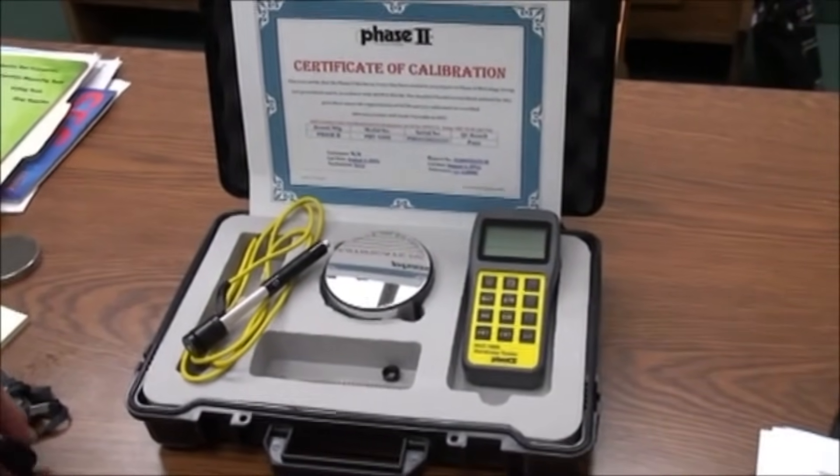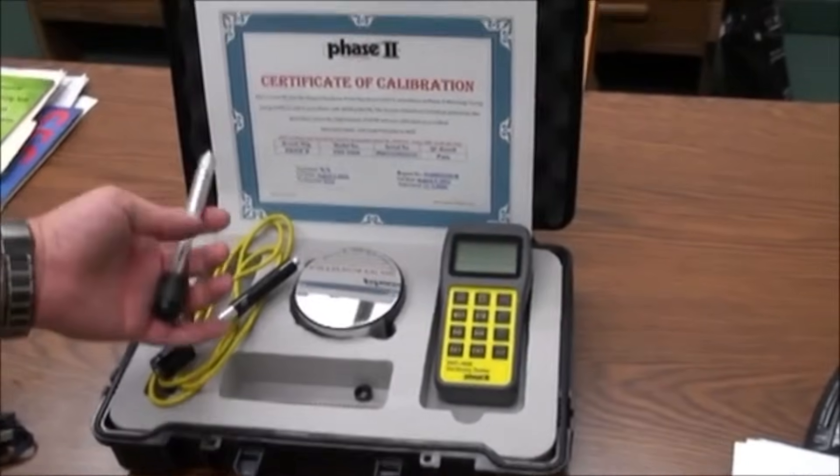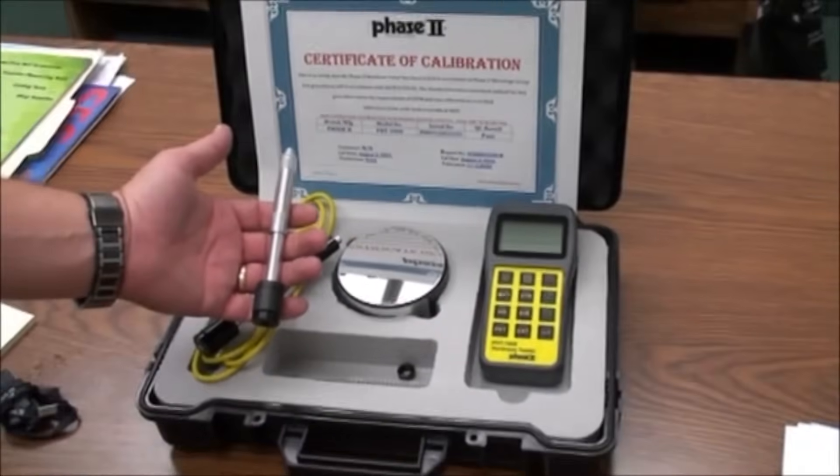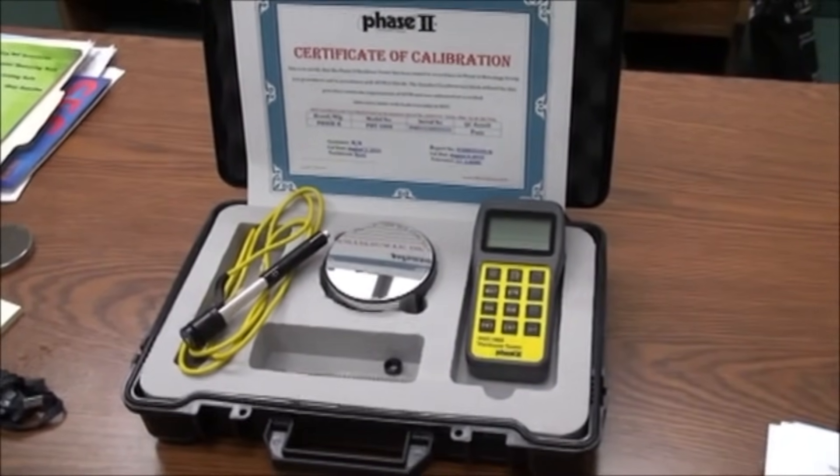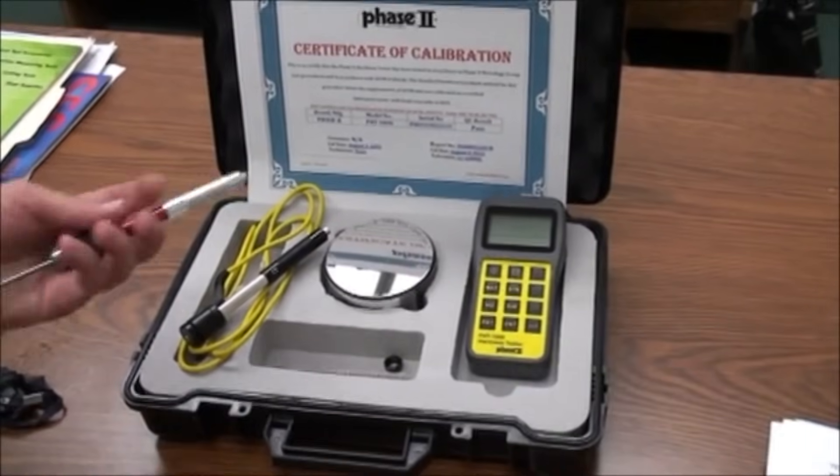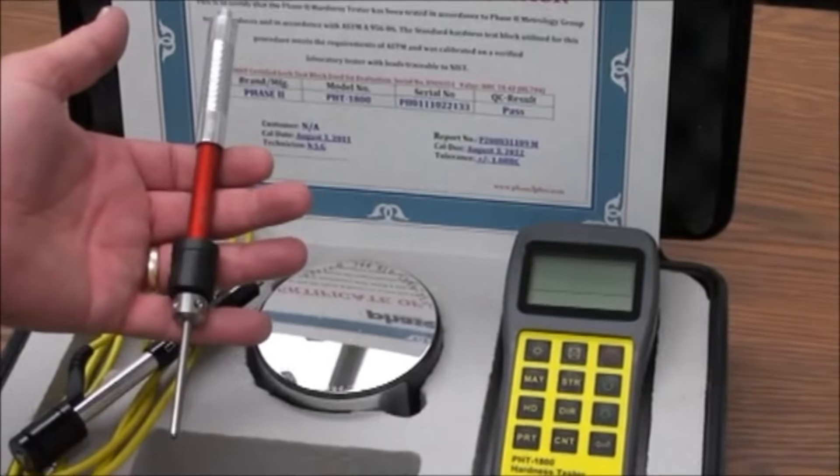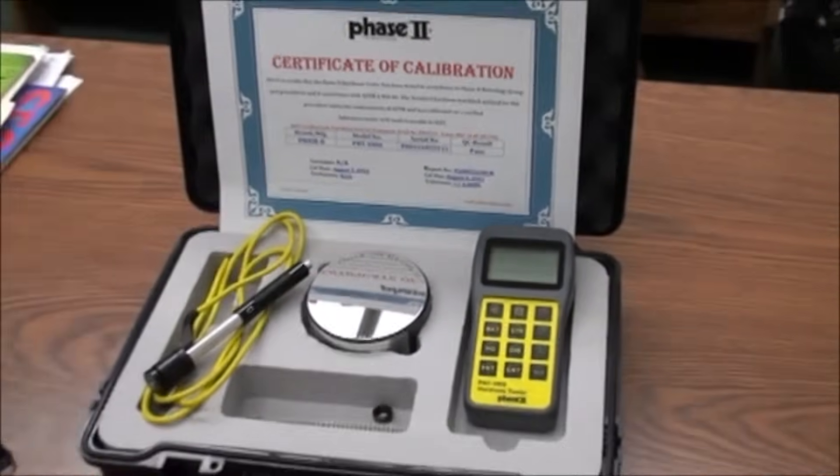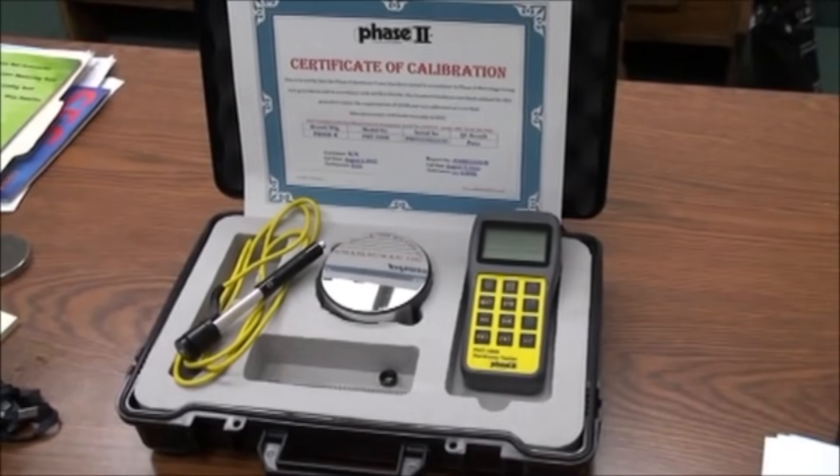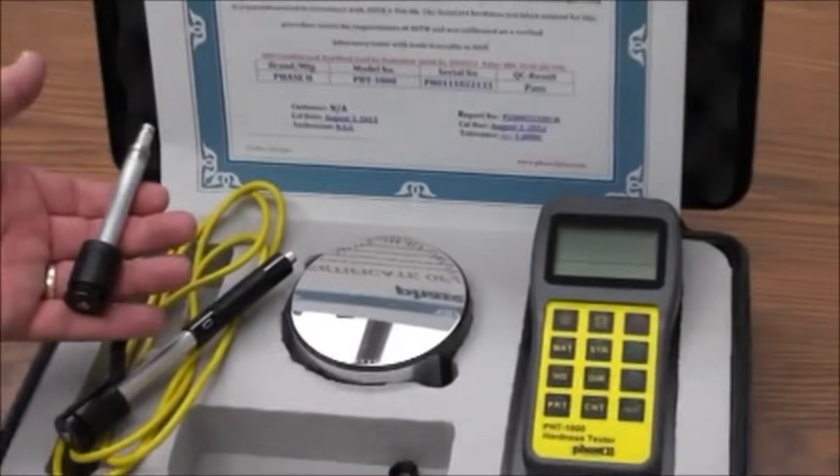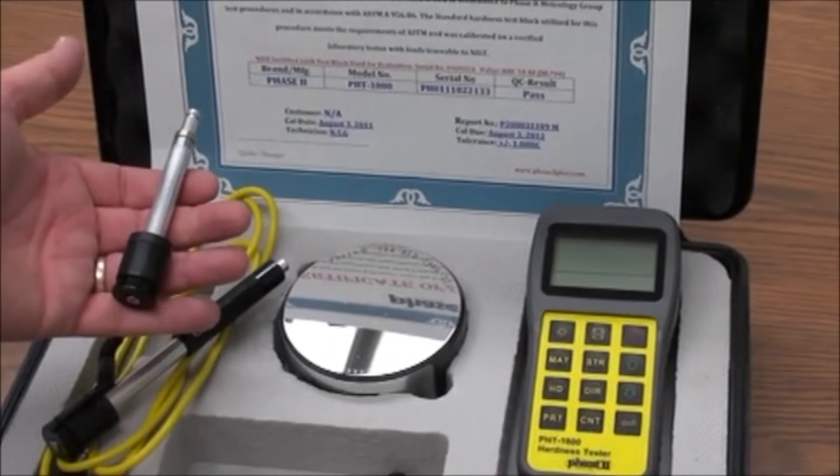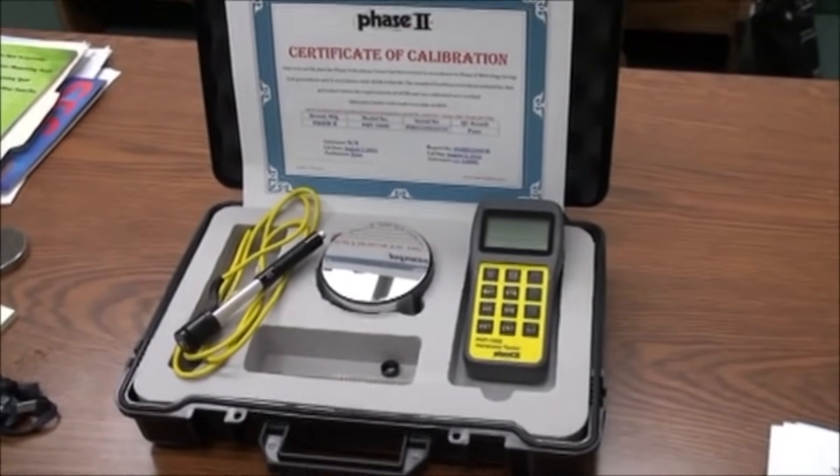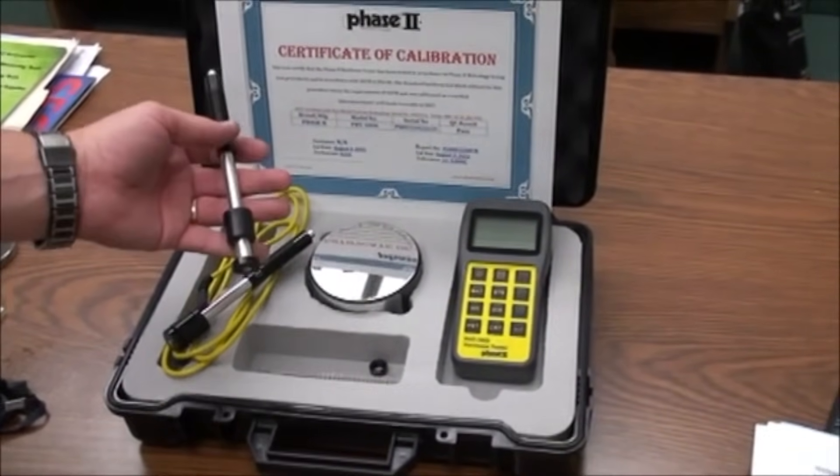The C-Probe is a reduced energy probe for case-hardened layers. The D-L probe has a needle-tight tip in order to test in tight places such as gear teeth. The DC-Probe is short to fit in small bores or confined areas.